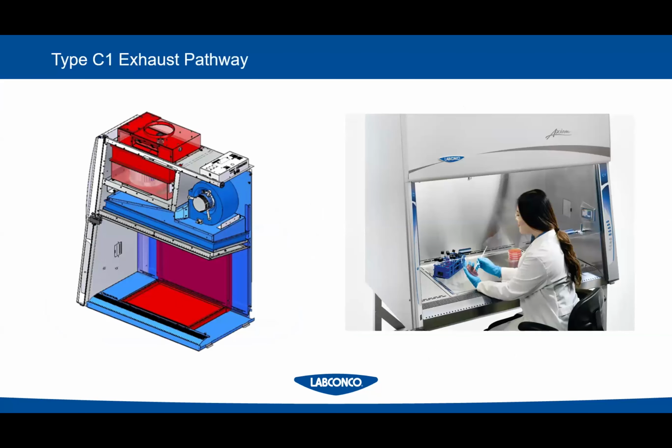This is kind of what the internal plenum looks like. You actually have two blowers in this cabinet, an exhaust and a supply.